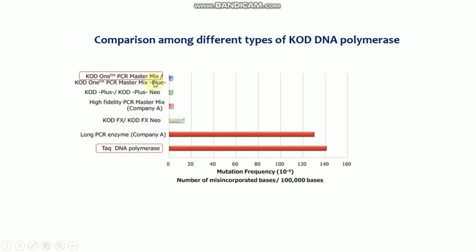But KOD1 is a little bit expensive compared to the other DNA polymerases.